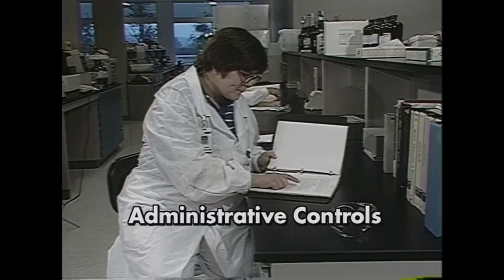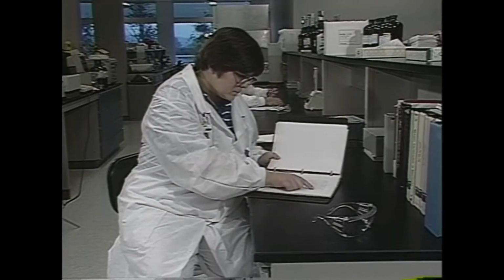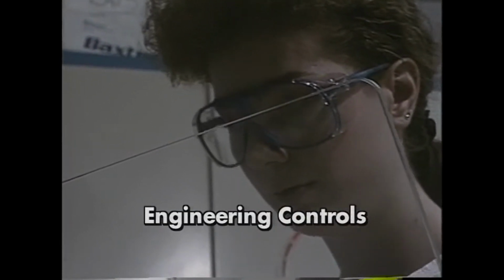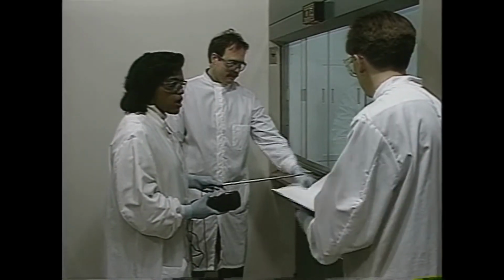Administrative controls can include general policies, specific procedures, and even work schedules that limit or eliminate your chances of exposure. Engineering controls are physical barriers or equipment, such as splash shields and laboratory hoods, that can reduce or prevent exposure.